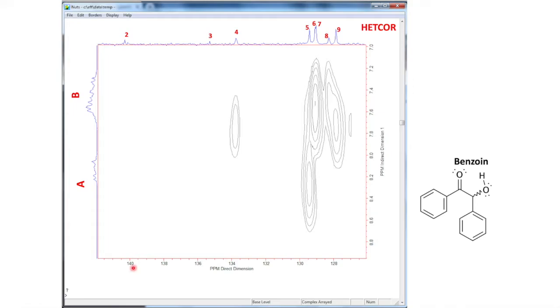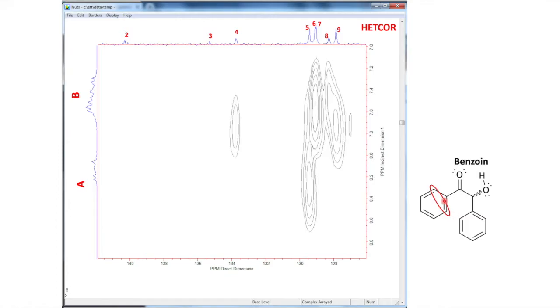You can look down at their values — carbon two is at 140. Carbon two and three have no hydrogens. The SDBS website told us hydrogens A are the more downfield ones — the two ortho to the ketone. The ketone is electron withdrawing, which makes sense from electrophilic aromatic substitution. The sp3 carbon with oxygen might be slightly withdrawing, but sp3 carbons are usually electron donating, so it makes sense they'd be more shielded. We've got those two hydrogens as signal A, and it looks like they line up well with carbon five. I'm going to take a guess that carbon five corresponds to hydrogens A, which also integrates to two hydrogens.